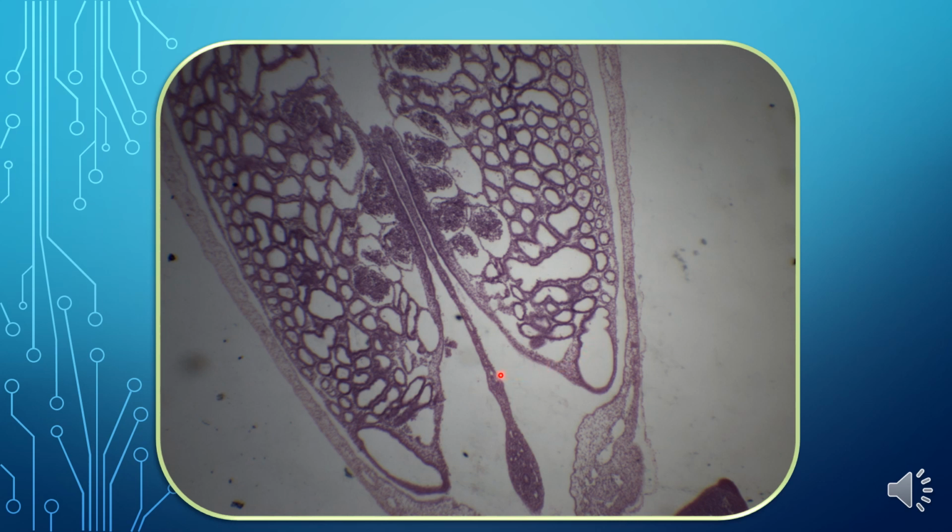Also in these sections you can see the hindgut containing the dorsal mesentery only. The hindgut has a dorsal mesentery only. This is the dorsal mesentery of the intestine, and the cavity of the renal system, the peritoneal cavity.